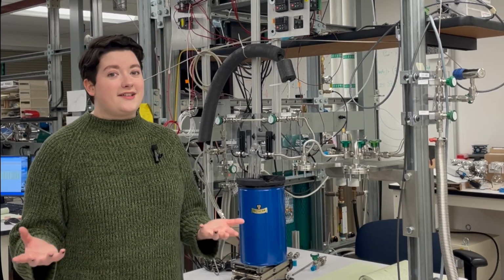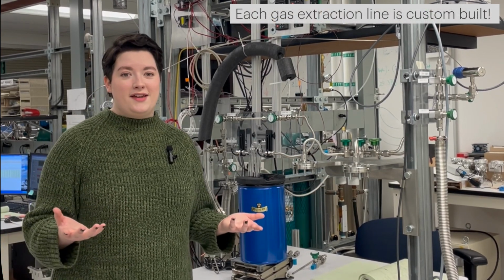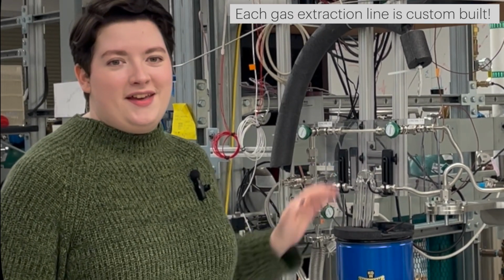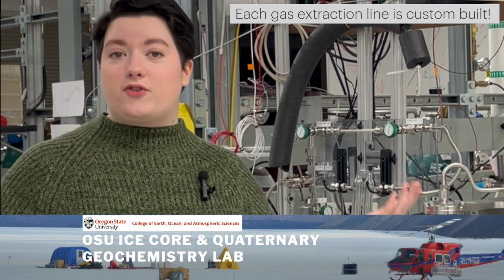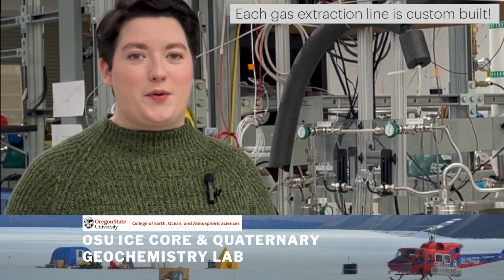No one sells gas extraction lines pre-made, so we build each one to do what we need it to do. This line even uses hooks meant to hang towels on your wall. Designing, building, and testing this line has been the bulk of my own PhD project. Other extraction lines in our lab were built by other graduate students and engineers over the last 20 years.